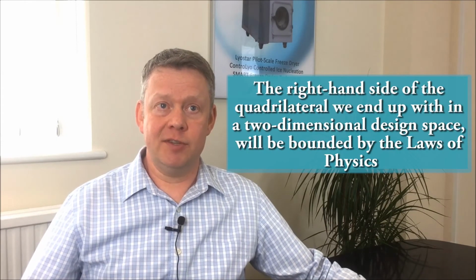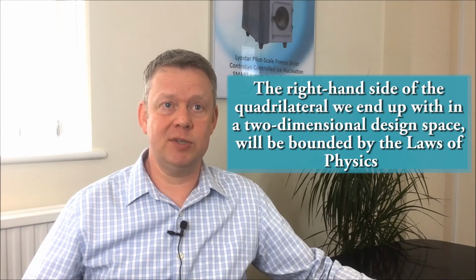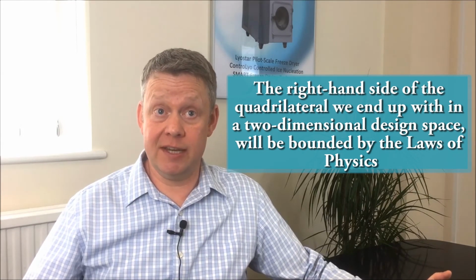And typically, if we think of the design space for primary drying, which for most people is the highest risk part of the process and the longest part of the process, so it's the part that we typically focus on with QbD, then the right hand side of the quadrilateral that we tend to end up with in our two-dimensional design space will tend to be bounded by the laws of physics. So for any given temperature, you can only go to a certain pressure. You have to be below a certain pressure, and that comes from the phase diagram of water.